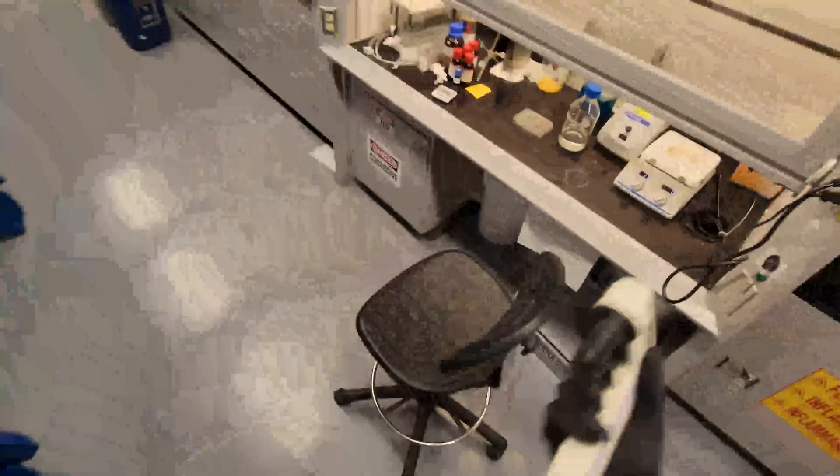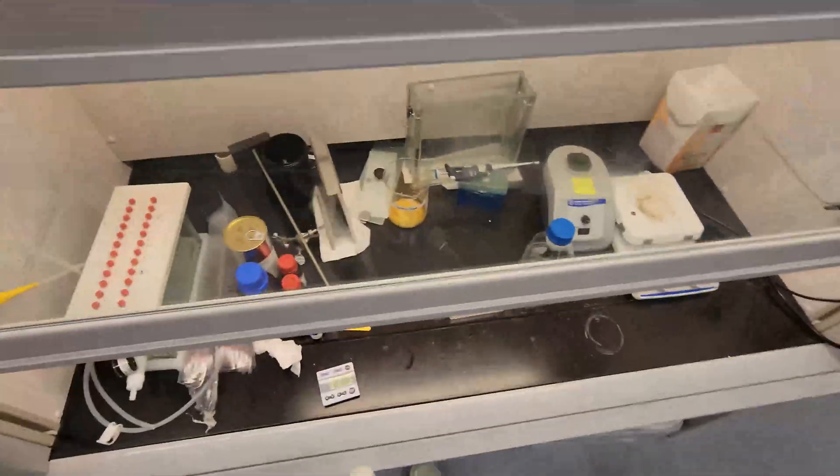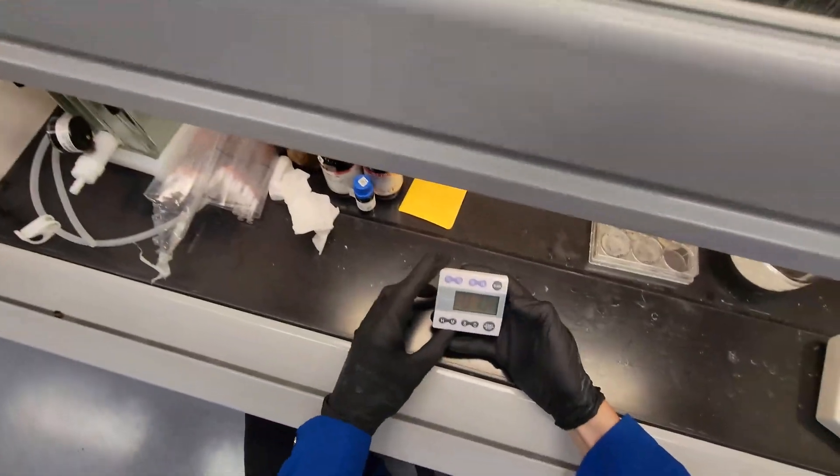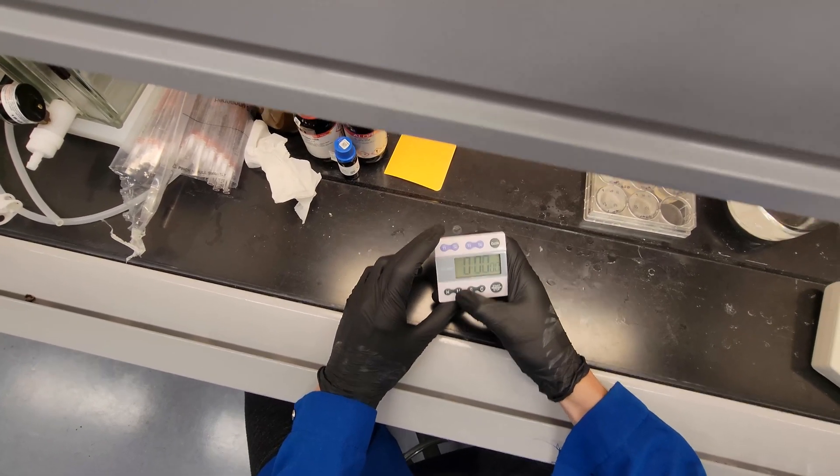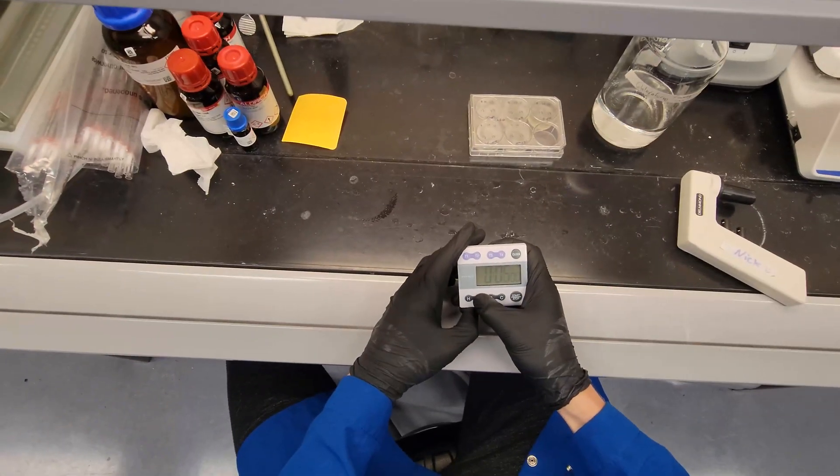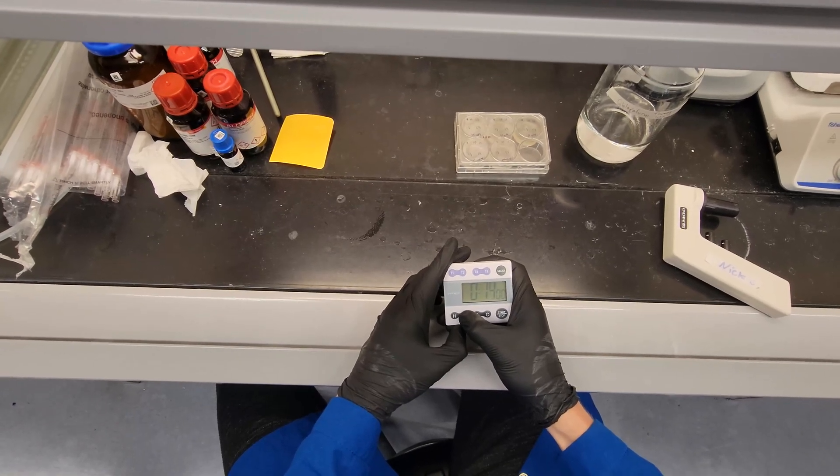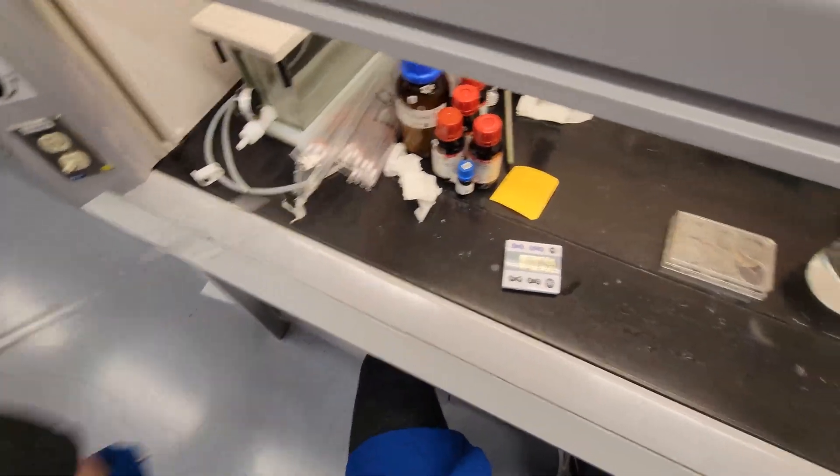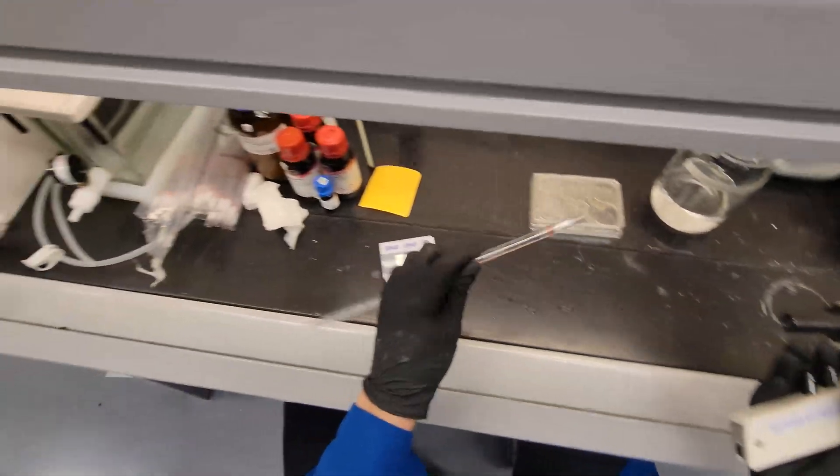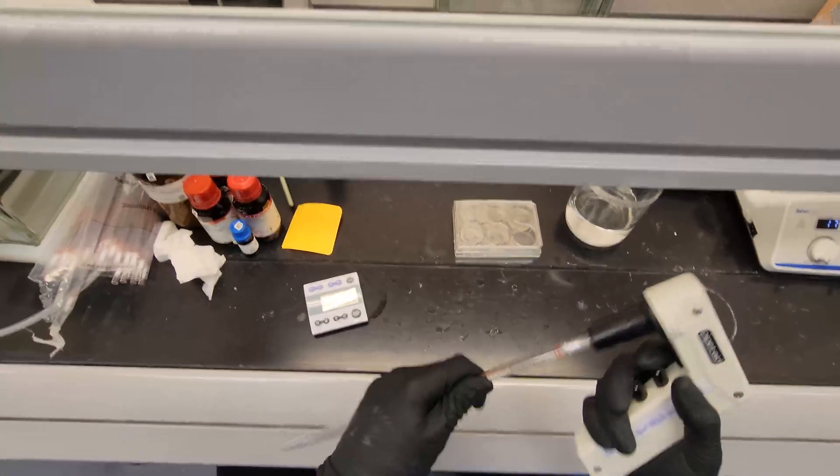I'm going to use this pipette here. If it's your first time, maybe just use a one-mil pipette to more gently put it on. All right, 16 minutes. Give me some time to set up. These are supposed to be sterile, but they probably aren't. So, this is a good application.